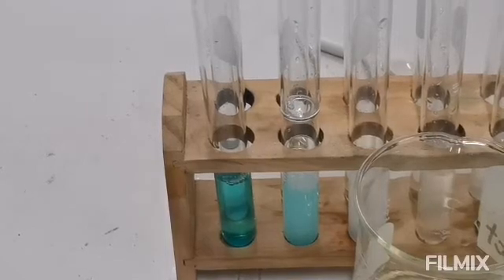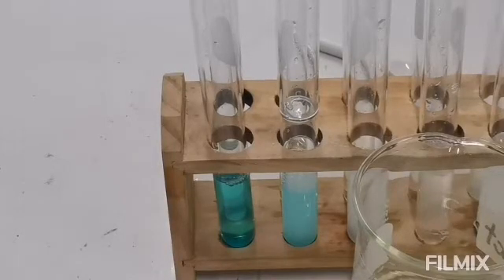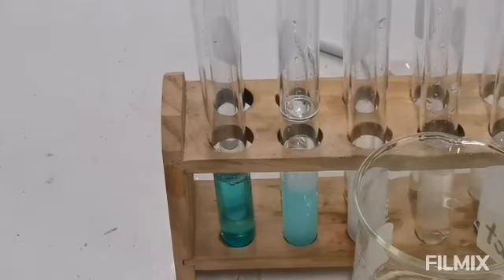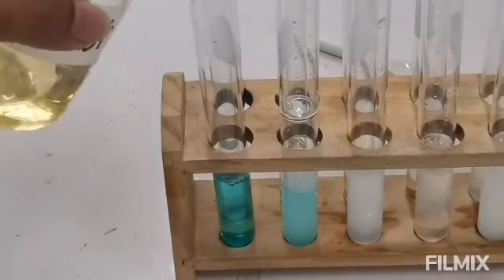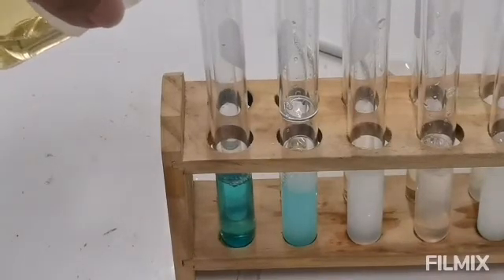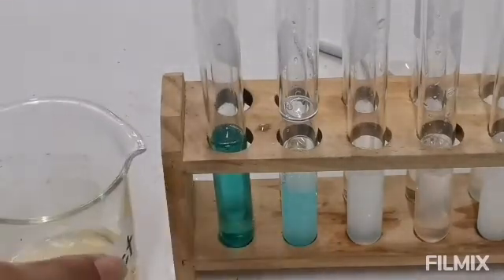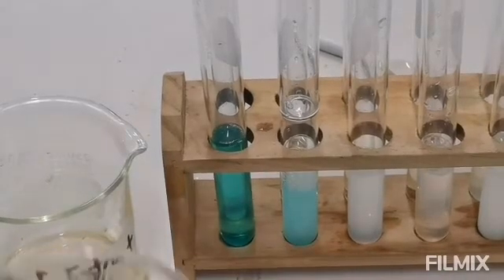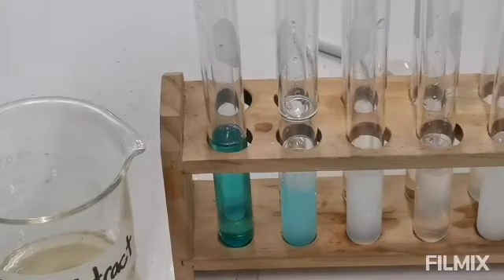We're back. Can you see the blue test tubes, the test tubes with blue liquid? These are actually solutions of copper sulfate and sodium hydroxide. This one, I'm going to add the beef extract, and the egg albumin for the other test tube.